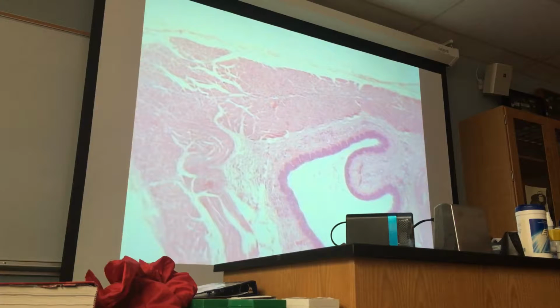Do you get that? So you have to do some kind of deduction. You have all the information, and then you have to apply your logic. I may ask you, name the organ. Esophagus. You have several features of esophagus here.